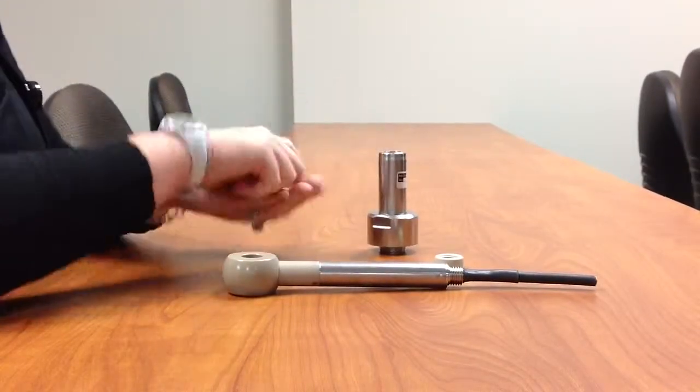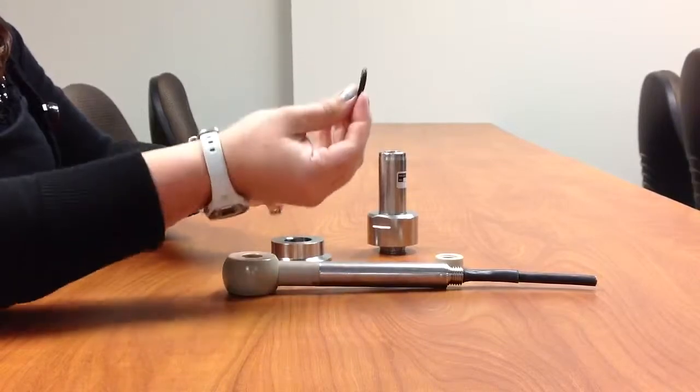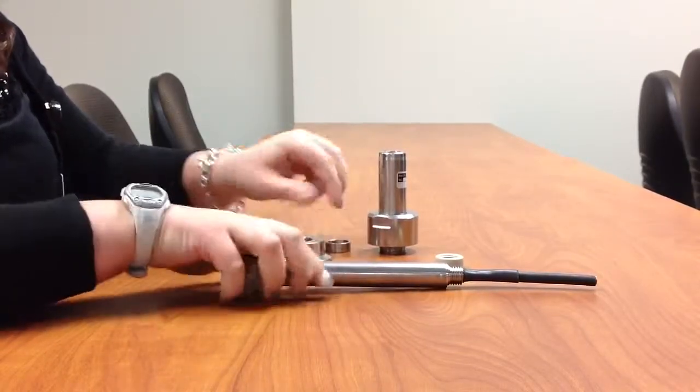There's the top piece, then here's your process connection piece, and then you have an O-ring and a sealing ring.